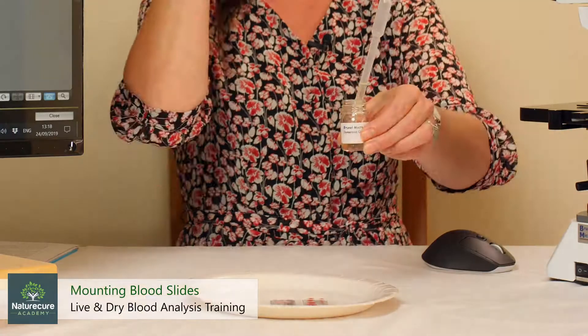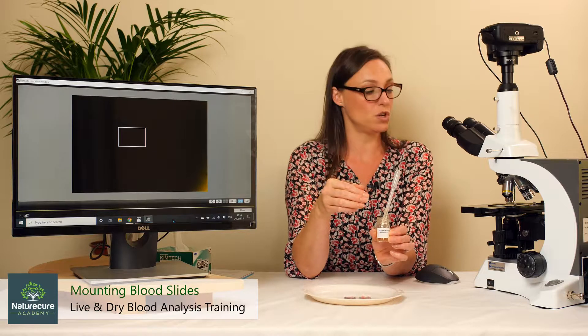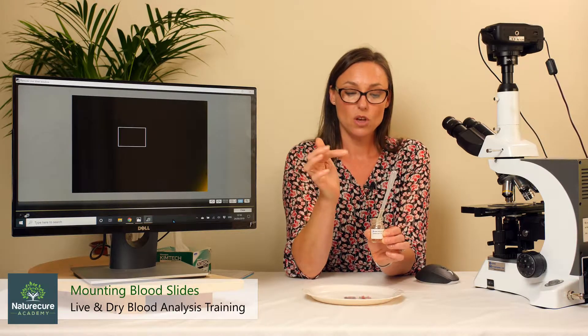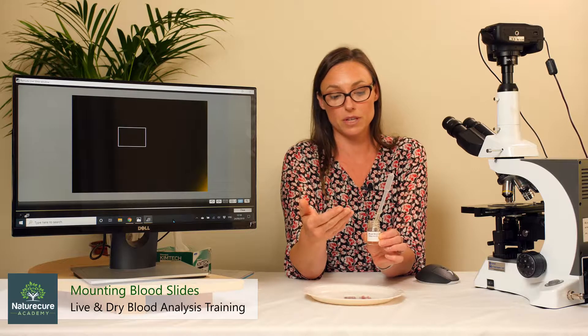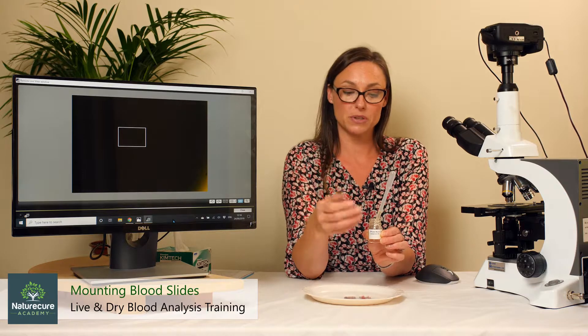We'll use the immersion oil. We're going to put a few drops of the immersion oil onto the top of the condenser. It's very important that you don't dribble it everywhere — it's very messy, very sticky, quite corrosive. And you always need to wipe it off when you finish, and we'll go through that process at the end.